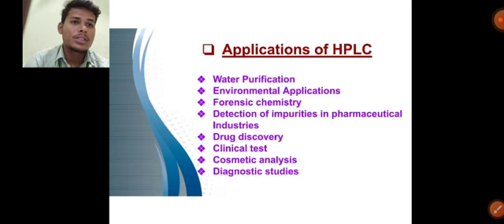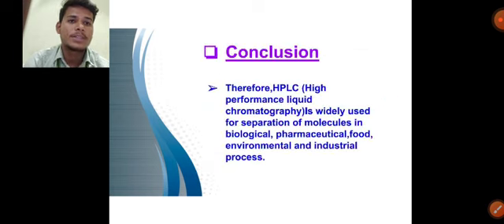The applications of HPLC, with examples: water purification, environmental applications, forensic chemistry, detection of impurities in pharmaceutical industries, drug discovery, clinical tests, cosmetic analysis, diagnostic studies.